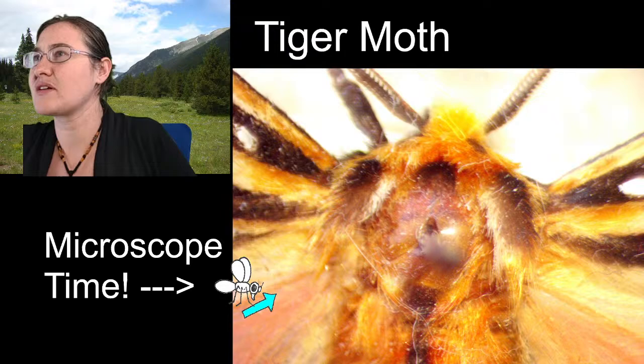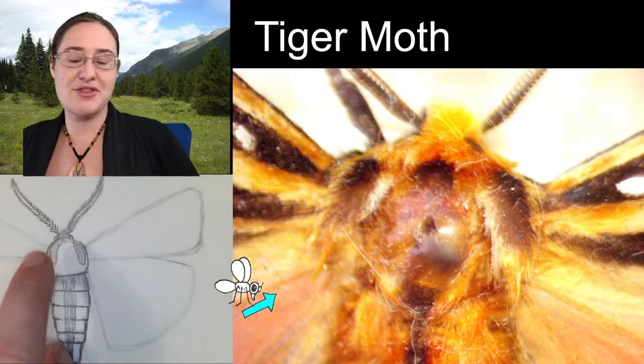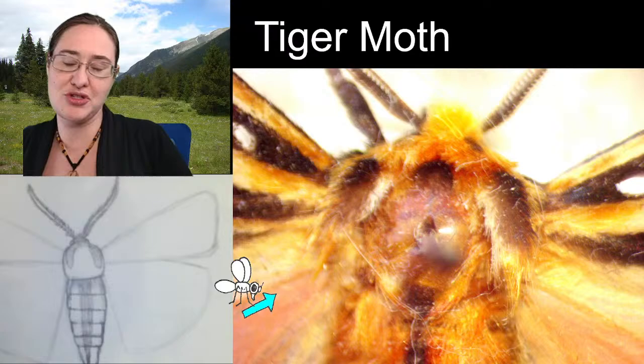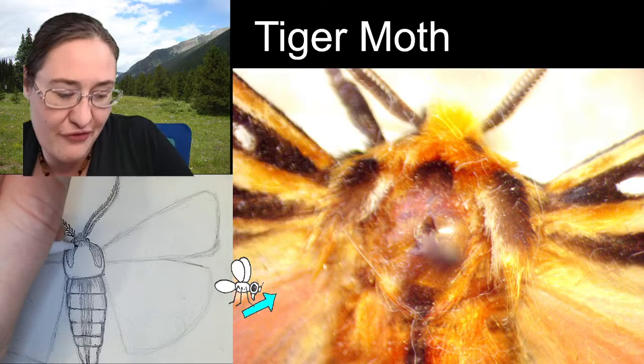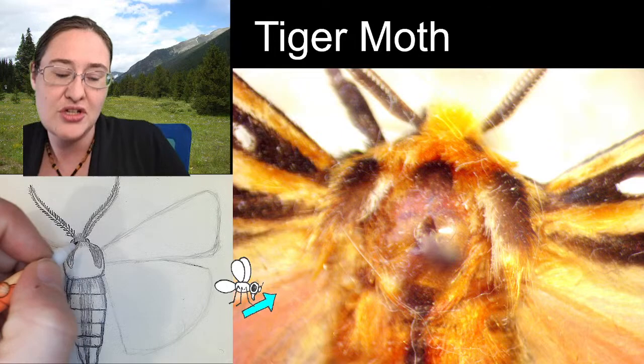I know I didn't add a whole lot of detail to my thoracic region. This specimen does have that kind of bare spot on the center of the thorax that makes it a little bit shiny, and that's not true to a living specimen. That shiny space on the thorax is due to the moth rubbing its scales off. So naturally it would have been covered.